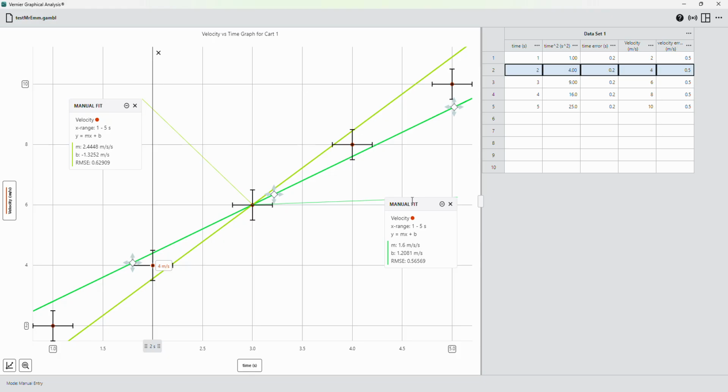Or if you want to make sure that the size of the graph and the quality of the image is consistent throughout your report, then I encourage you to do an export, okay? And this will allow you to export your graph as a PNG, as an image, and then you enter that to your lab report, okay? Maybe not necessary for your actual report now, but probably necessary for your final IA, okay?